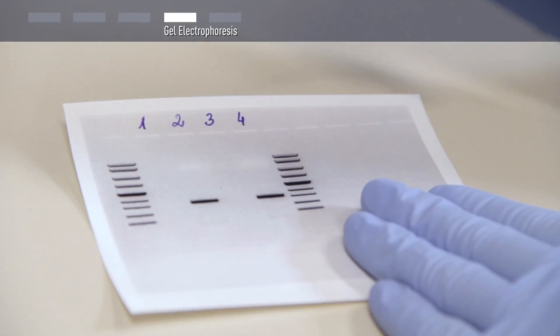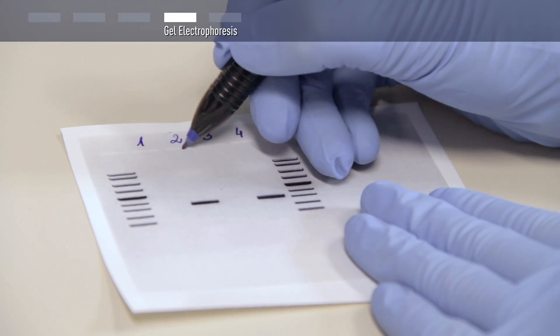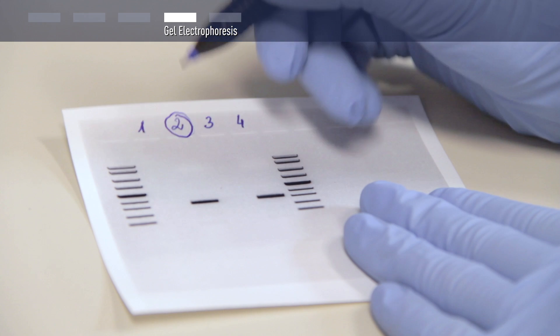After electrophoresis, analyze the DNA band pattern on the gel to identify positive colonies.